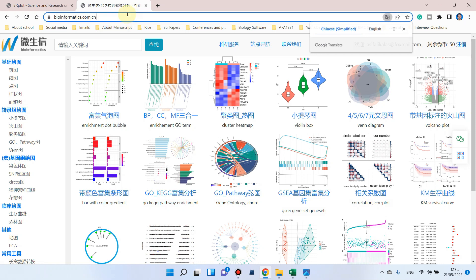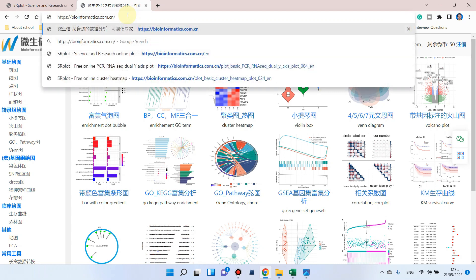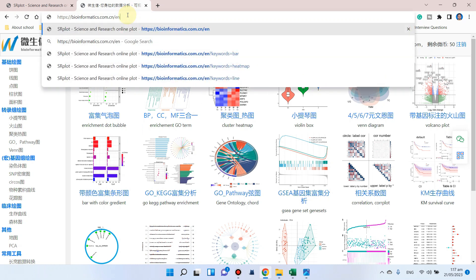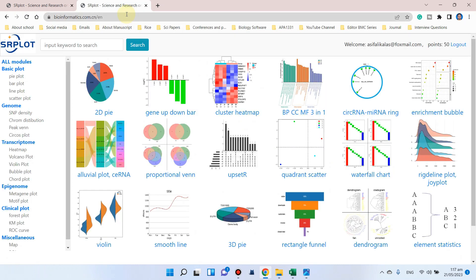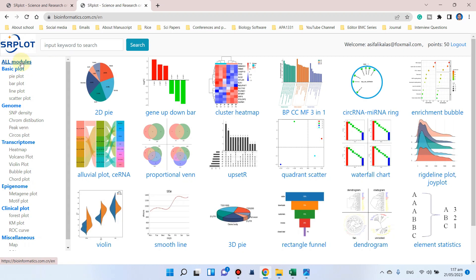When you click on this website, you can see it is in Chinese. Simply write slash EN, and it will translate to English. Now the website has been translated into English version. Here you can see we have all modules.